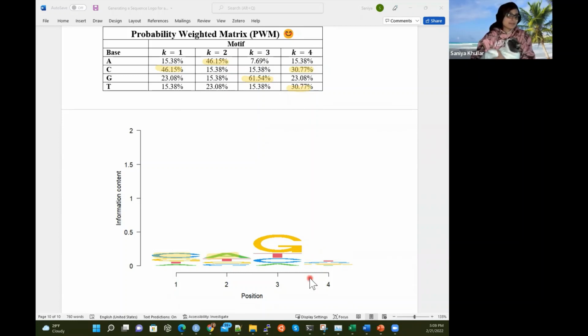So it really depends. In this situation, what they put on the top, I think, was the T's in red. Then they put the blue, which is a C. It's so small here because they put T and then C. It can be either or on the top. It could have been a C and then a T, then a G and then an A.